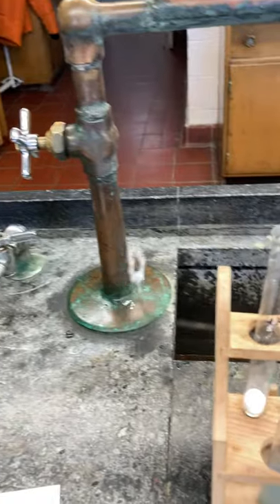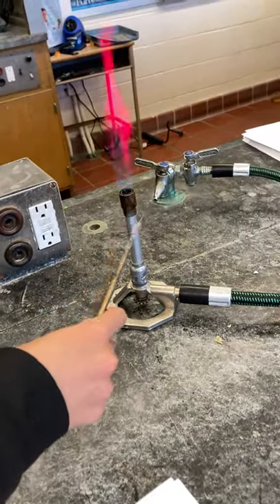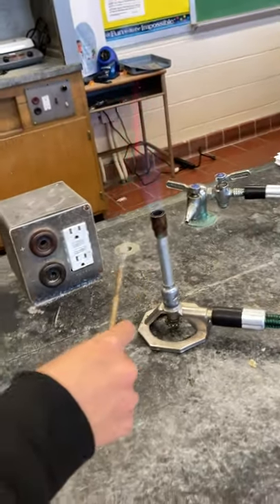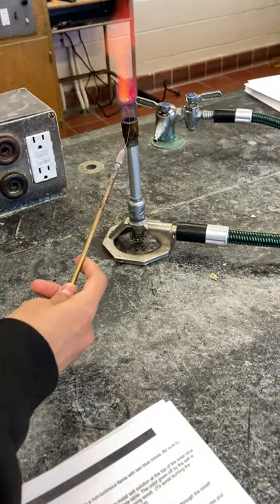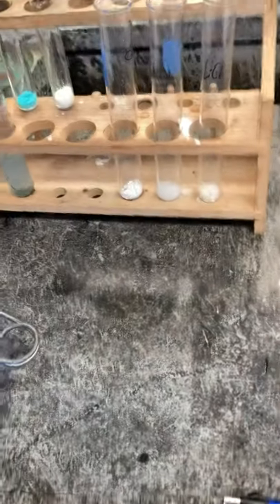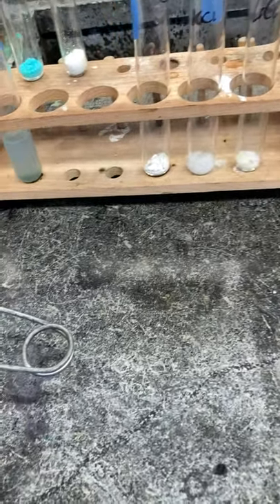Look at this. Let me try it. Don't sniff it, I swear to God. Yo. Oh, shoot. Look at that one. That one's sick, dude. That one's the best one. That one's red. Which one is this? LiCl. So that's confirmed red. That's why I say red is one of the best colors.